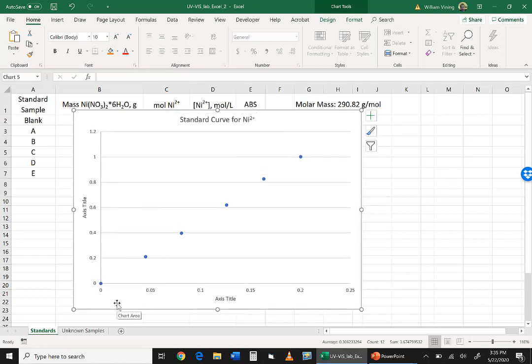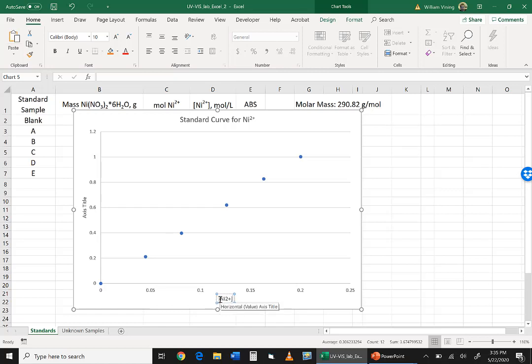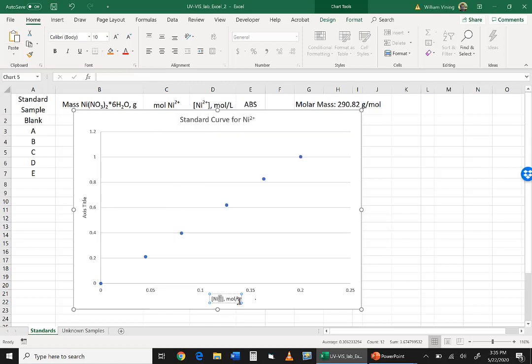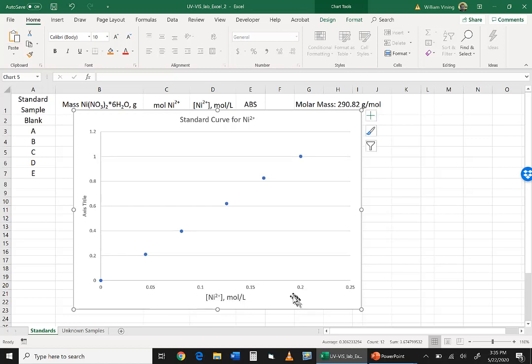And next thing we do is we want to put in our axis titles. So our x-axis is going to be concentration of nickel 2+, so it would be nickel 2+ in square brackets. And then you have to put the units in, so I'm going to put comma moles per liter. You can use a capital M for molarity, that's okay. And I'm going to highlight the 2+ and, again, make it a superscript. Okay. Now the problem is that's pretty small. That's a very, that's an important thing. So I'm going to take that there. I'm just going to make it, say, 14 font to make it bigger.